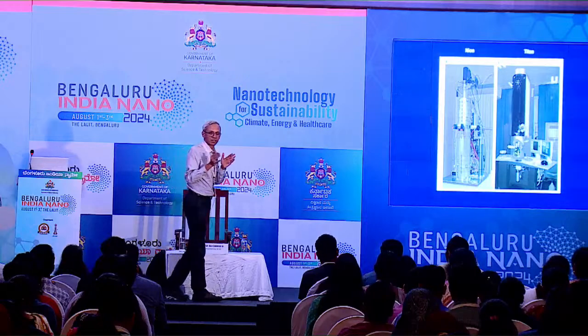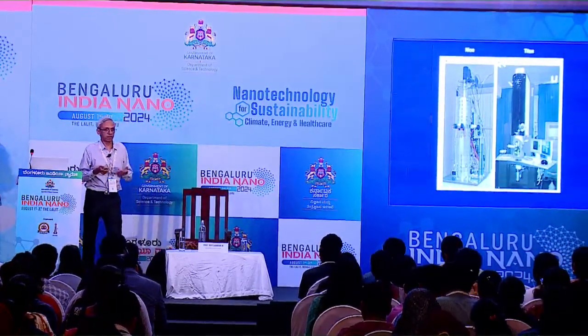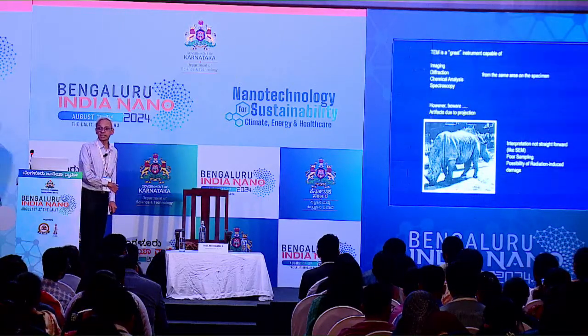And so it's very difficult to compress it in one hour. So rather than that, I'll give examples. Hopefully you can relate to some of these examples from your own work, and then you will probably gain something. Okay. So what then can the TEM do?